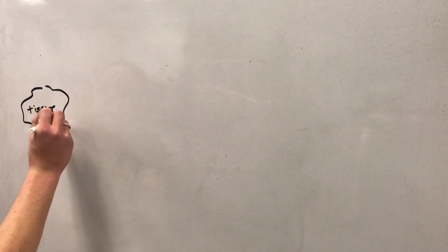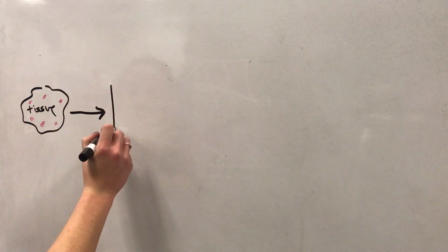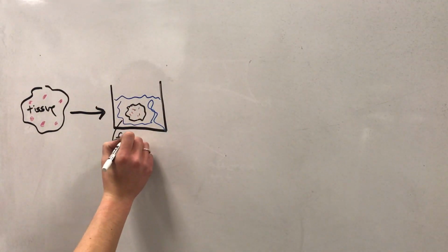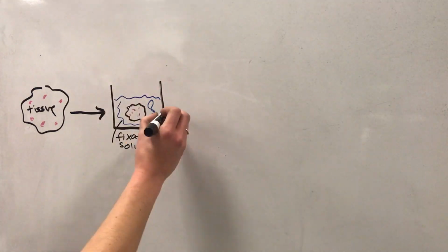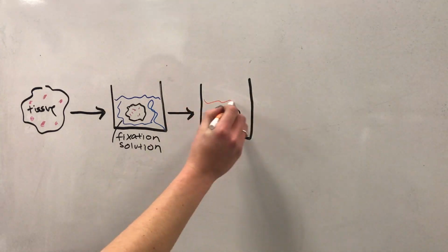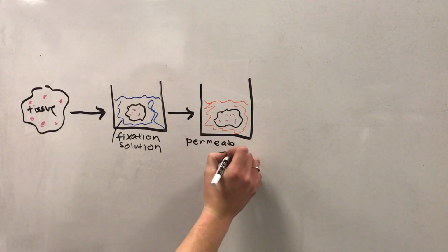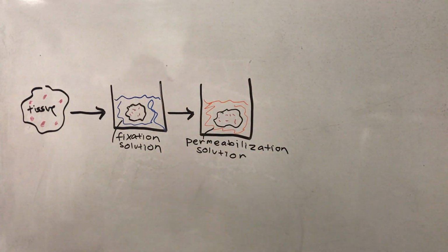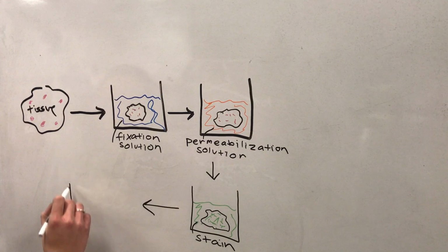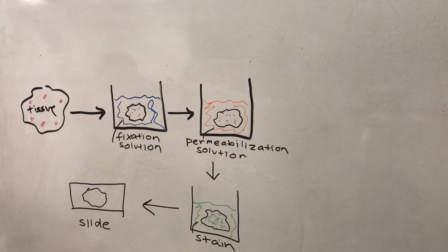TPM is used to image biological specimens, which must be prepared in a specific manner. The preparation of a sample can be broken down into 3 steps: fixation, permeabilization, and staining. Tissue fixation helps preserve cellular organization. Permeabilization is necessary to allow staining solutions to pass through the plasma membrane and access internal cellular structures. The staining of a sample, done by using a fluorescently labeled antibody, makes the sample fluorescent and gives it visibility in the microscope.